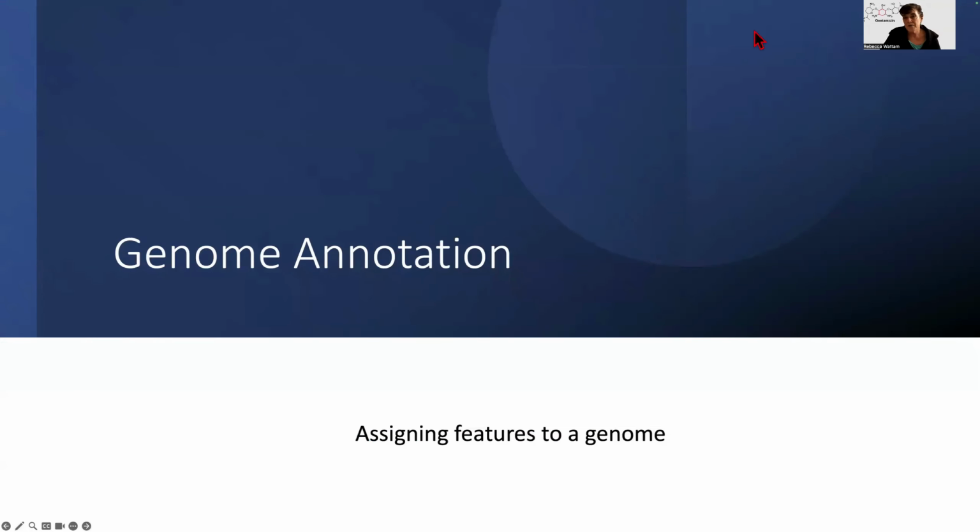If you've been watching this video series, there are probably some services that you thought were pretty amazing. And for me, generally, when I think of assembly, that is like the pinnacle of bioinformatics. You're taking millions of these little reads and using this pipeline, you're assembling them into contigs. Maybe 1,000, not good. Maybe 100, not bad. Maybe even just one. I mean, it's an amazing process.